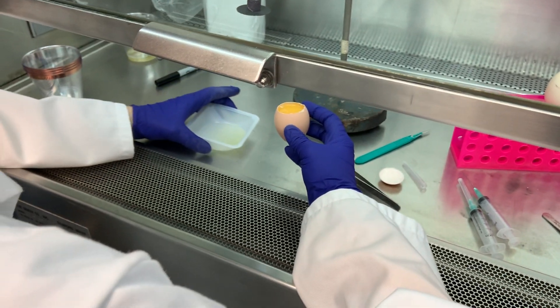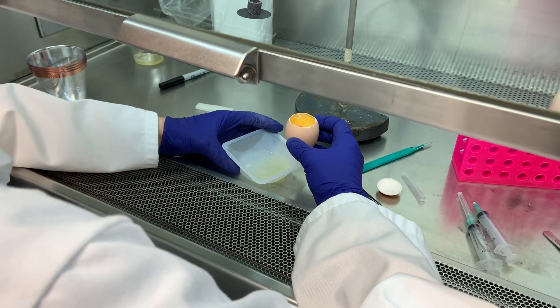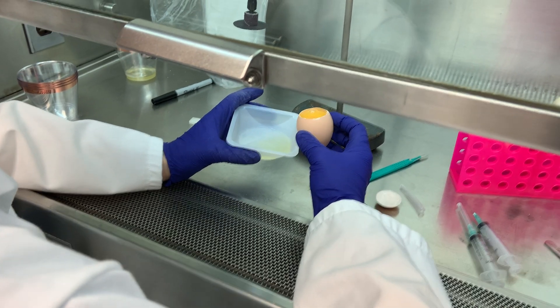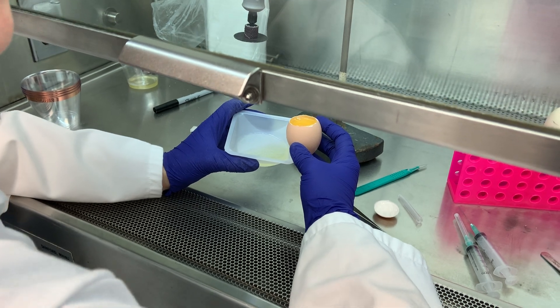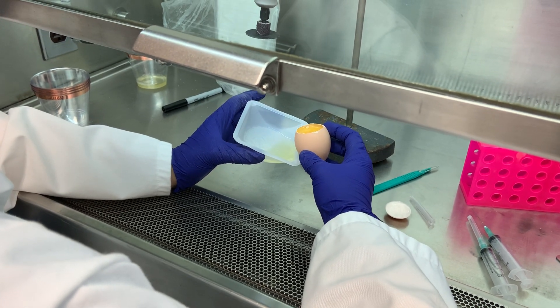So now the challenge is to transfer everything that is still inside the egg into our vessel, into our wayboat. This part is kind of — once you commit to pouring, you just go for it, and then we can kind of manipulate it afterwards. So go ahead.